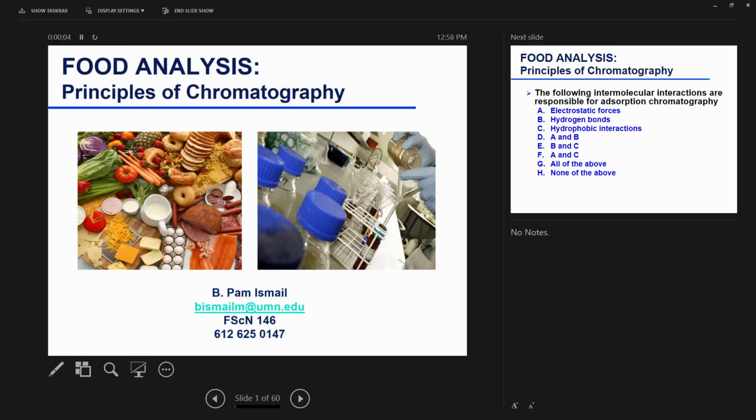Chromatography. It's the best topic ever. We're going to spend about 4 lectures on basic principles of chromatography. All right. Who can define chromatography? What is it? So nobody can, didn't you learn about chromatography in any of the previous chemistry classes you've taken? Okay, so I see heads nodding. All right, so what is it? What do we use it for? Just simple. Okay, Bailey.